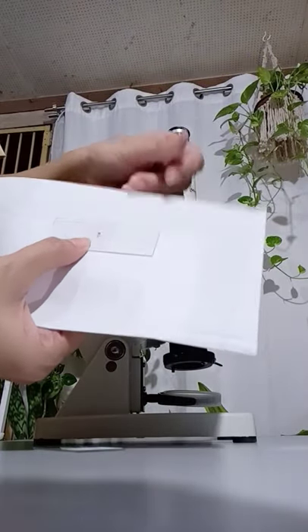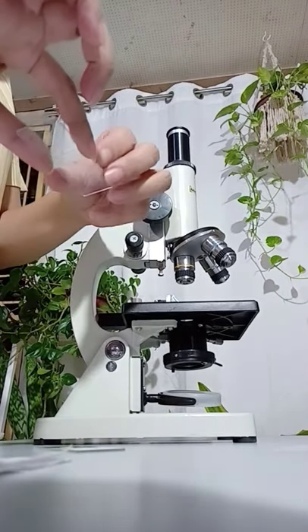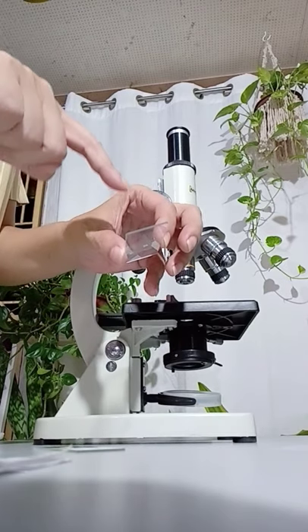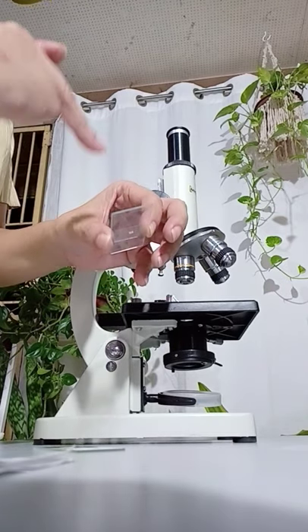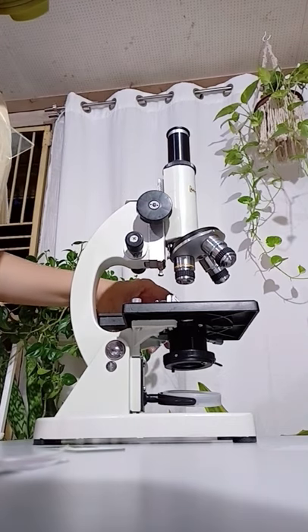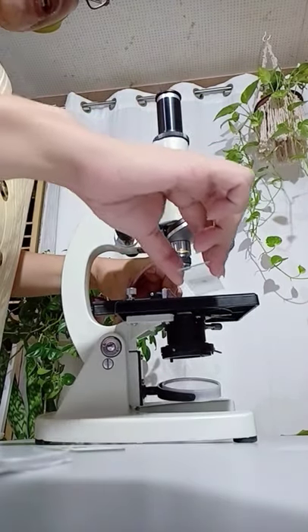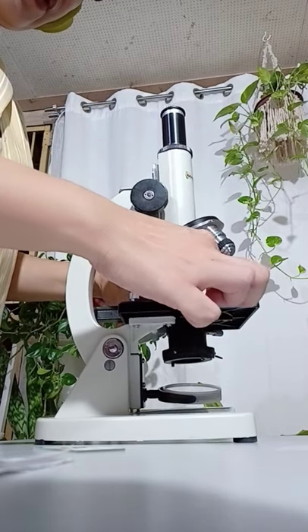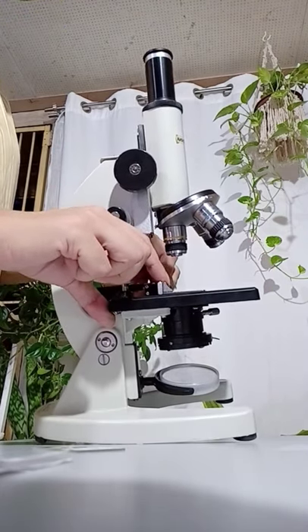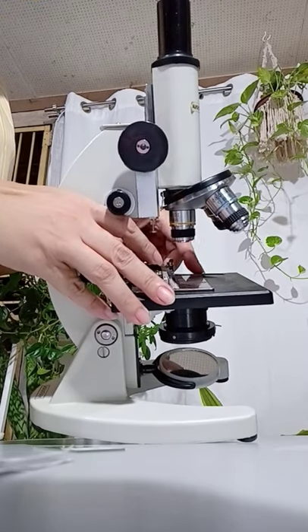Next, I position this wet mount, or fresh mount, on the stage, making sure that the letter E is facing me so that I read it uprightly the way I write it. Positioning the slide on the stage requires you to make way by adjusting the stage clips to the side. Make sure that one corner of the glass slide snugly fits the angle, while the other corner is fastened directly by the stage clip.